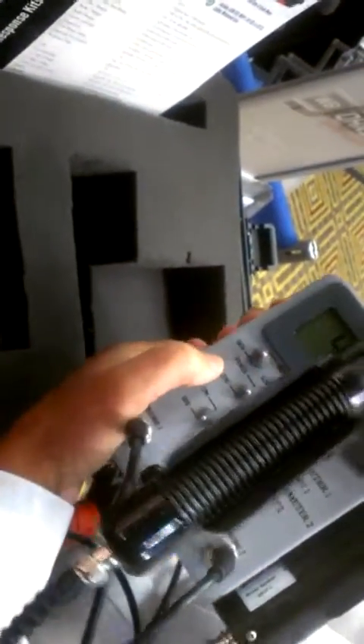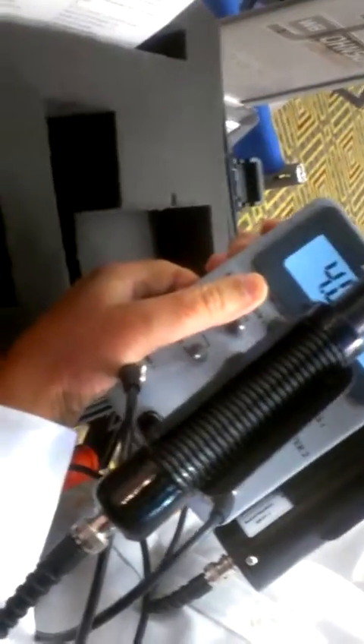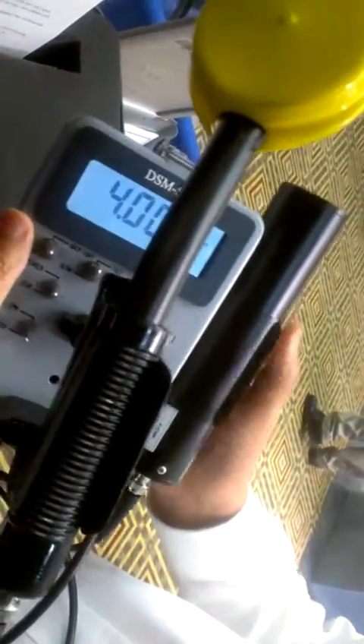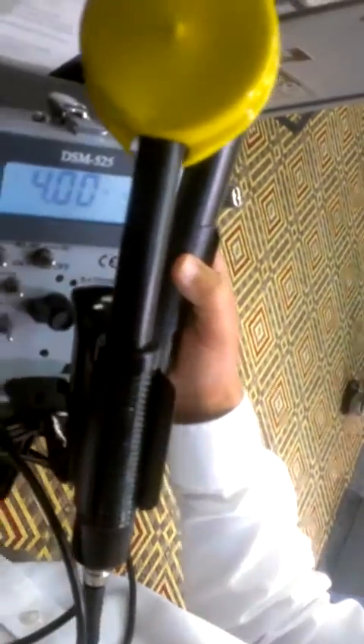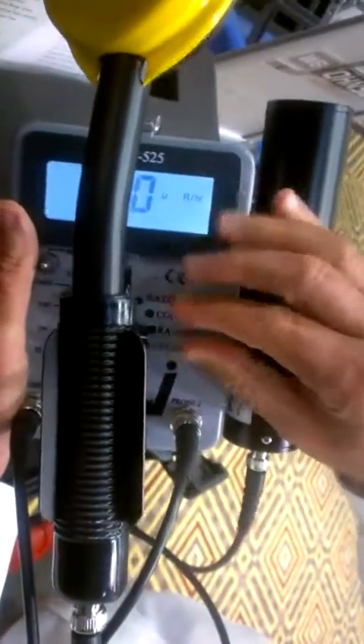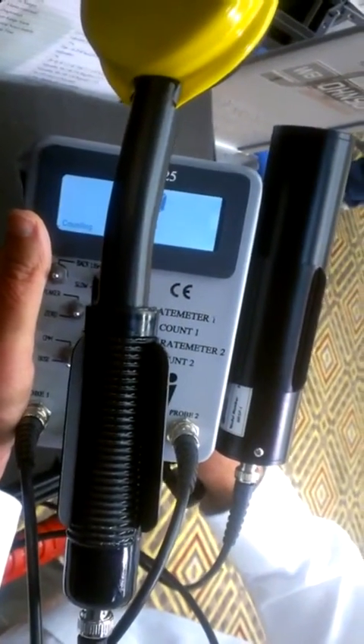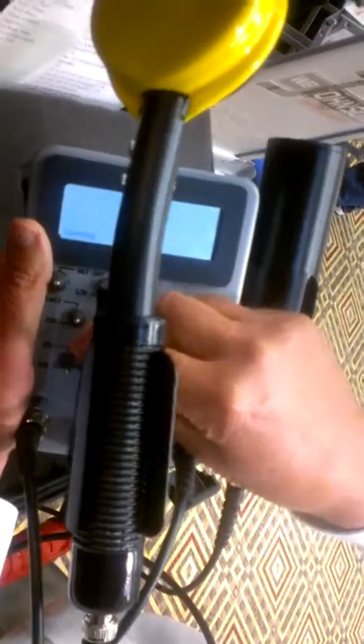Large digital display — largest in the industry. Very bright backlight, which can be seen from a long distance away. Usually three to four hundred hours of operation on six AA batteries. All our instruments come standard with a scaler for each detector and alarms.